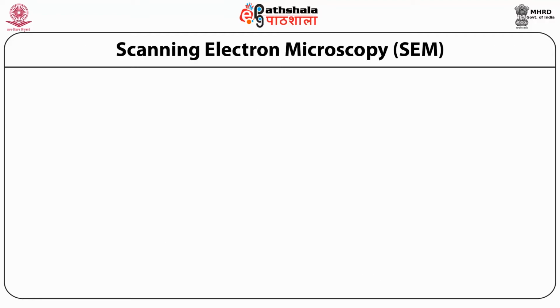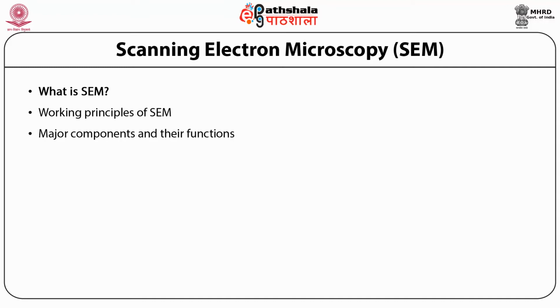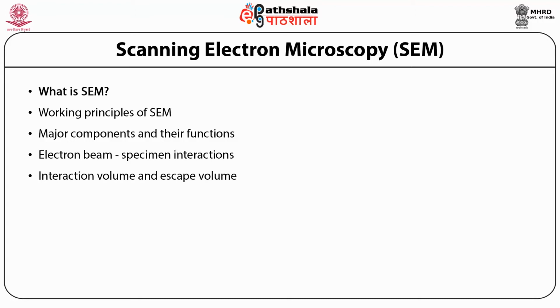Now let us discuss scanning electron microscopy, SEM. We will be discussing first what is a SEM, the working principles of SEM, their major components and their functions, electron beam specimen interactions, interaction volume and escape volume, magnification, resolution, depth of field and image contrast.